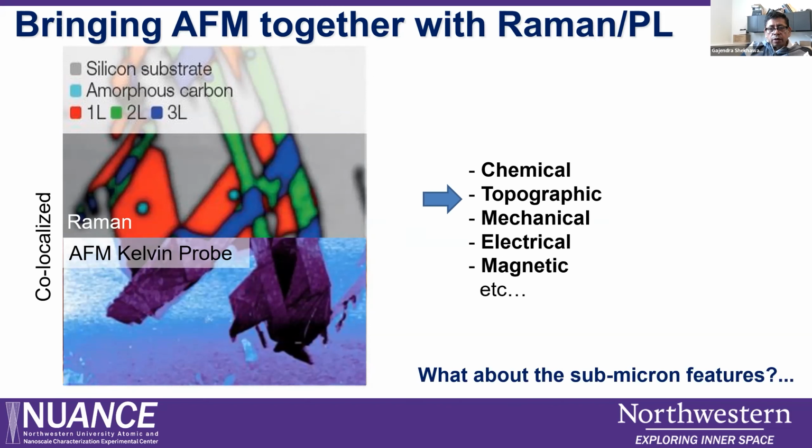So can we image chemically any features? AFM can always be used, allowing us to image features as low as a nanometer, even less than a nanometer resolution. But how do we do it with chemical resolution? Because we are limited by the optics of the Raman.